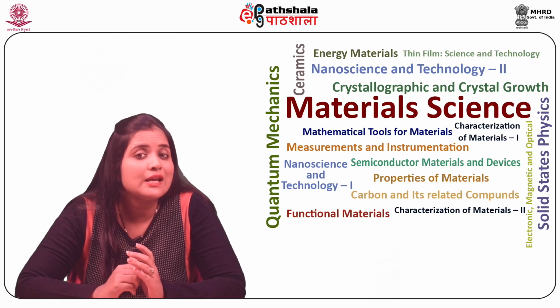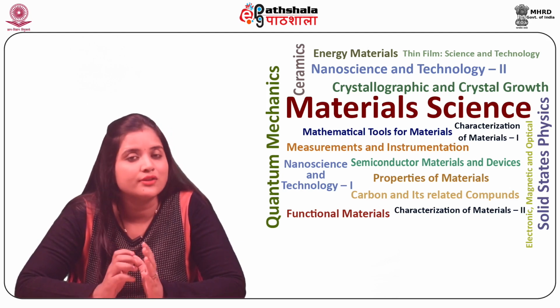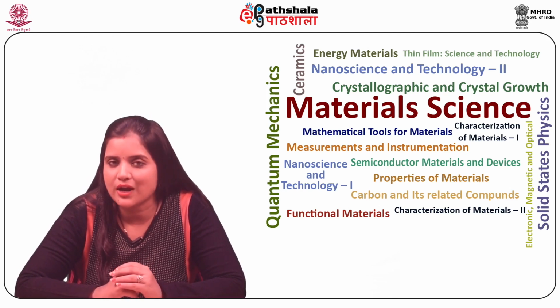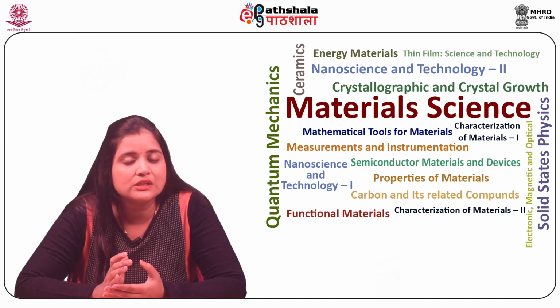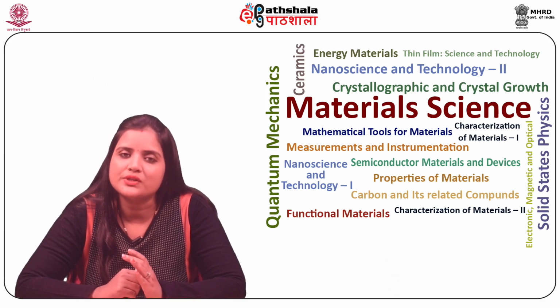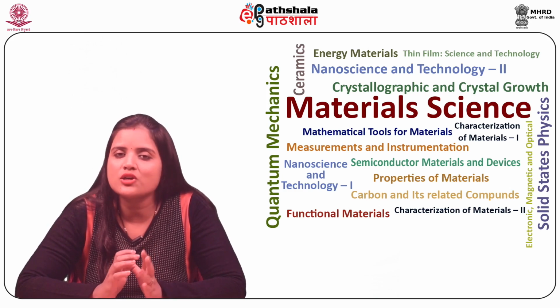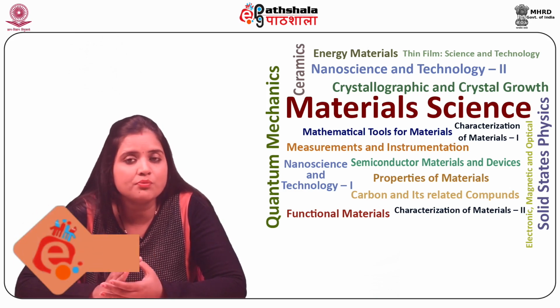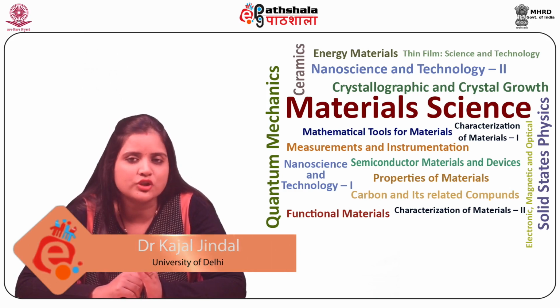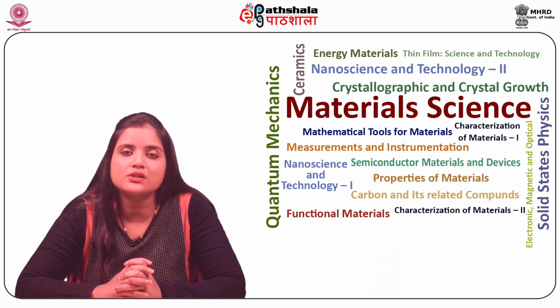So students, let us now summarize what we have learned in this module. In this module, the concept of the oil immersion technique was described. The various properties of immersion oil and the effects on the optical system were discussed. The objectives, advantages, and disadvantages of oil immersion microscopy were discussed in detail. Finally, quantitative metallography and its methods were studied. Thank you, students, for your attention.